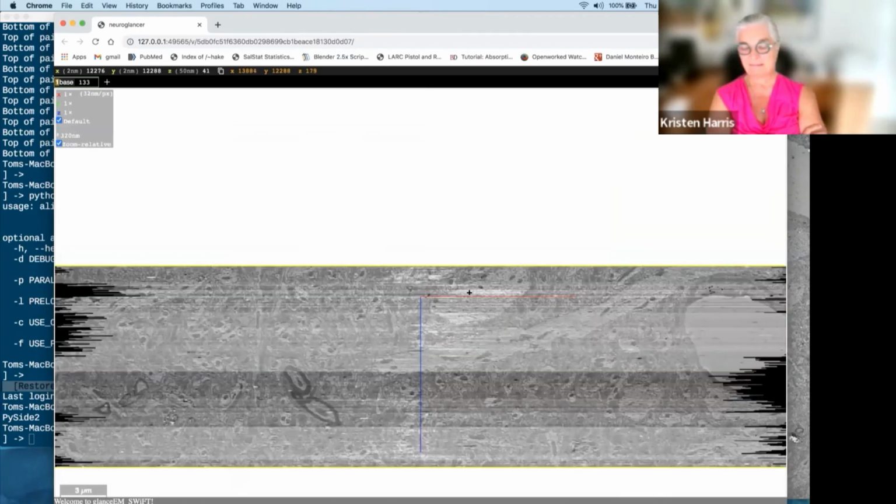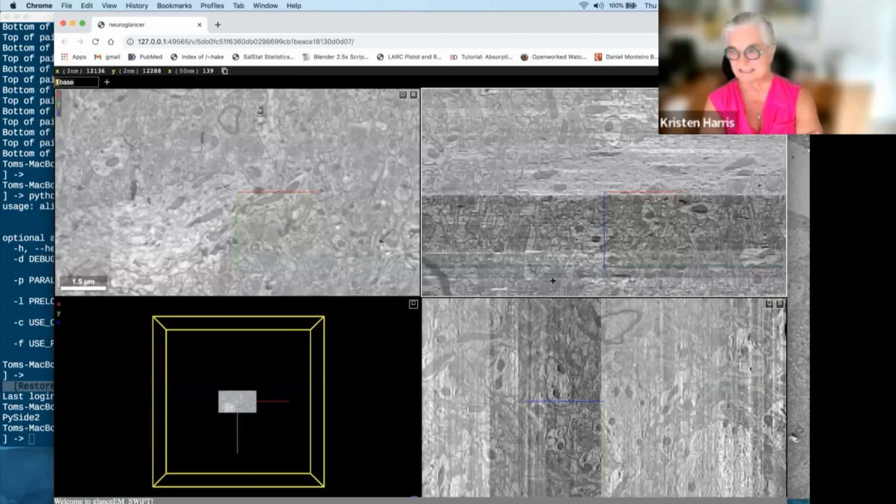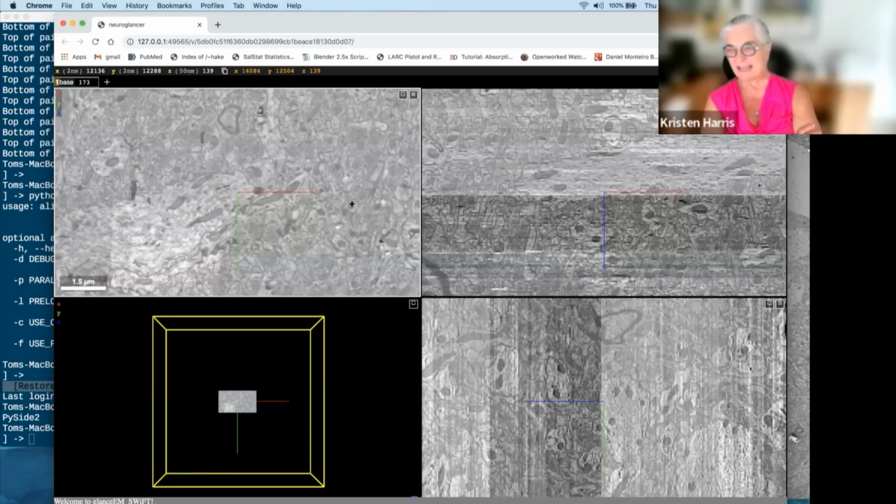And I'll tell you, Michael in his inhibitory dendrite project has figured out how to calculate that based on the smooth Z trace from Reconstruct. He can't visualize it at a different section thickness, but he can quantitatively analyze it at a different section thickness.